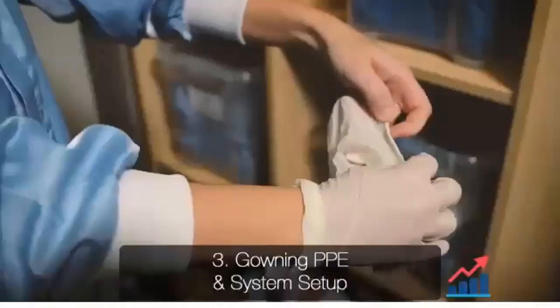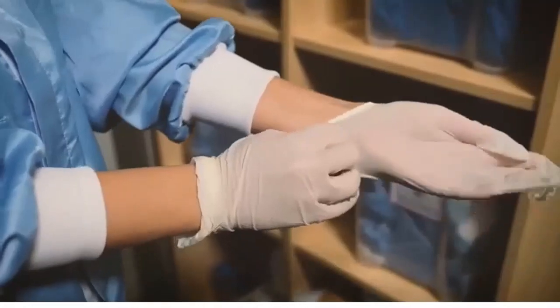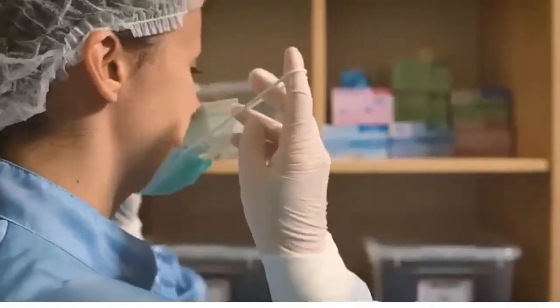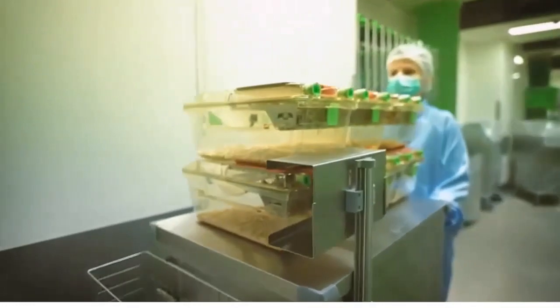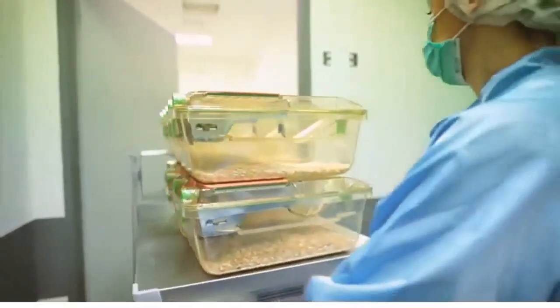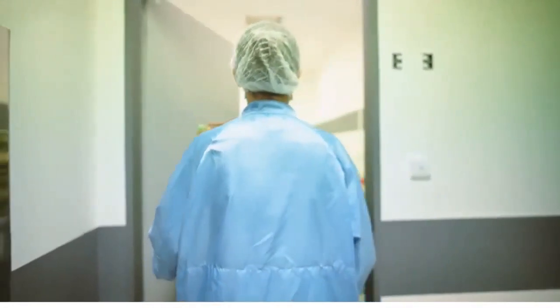Streamlining this information is key, as it gives staff members a full picture of what their workflow will be for the day. So once the animal caretaker gowns up, they can go directly to the clean side area to gather their supplies. For this particular task, the animal caretaker will only have to change a few cages instead of a full rack. This approach allows the animal caretaker to enter the room with the supplies needed to complete their assigned task.